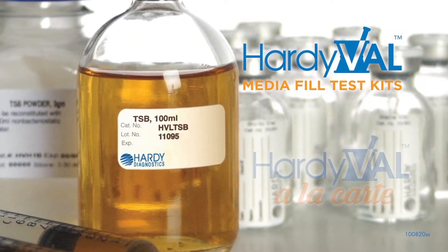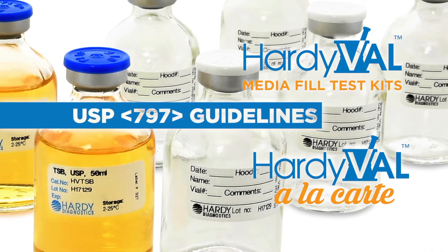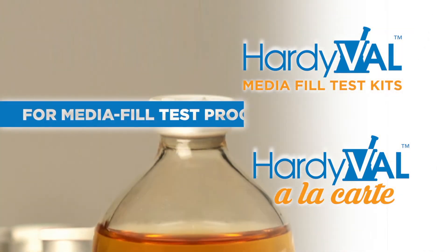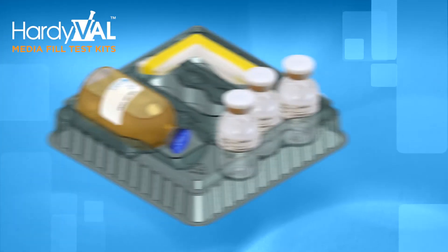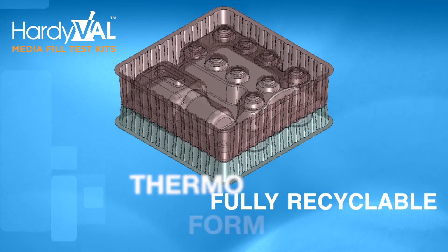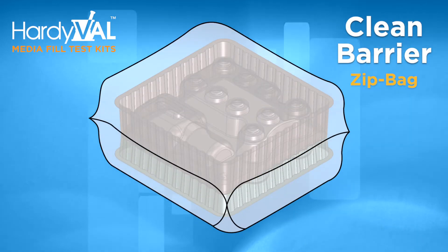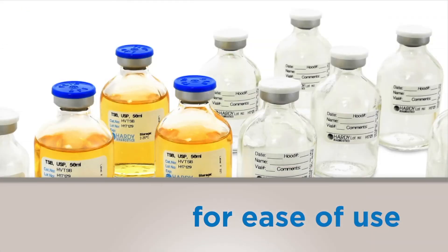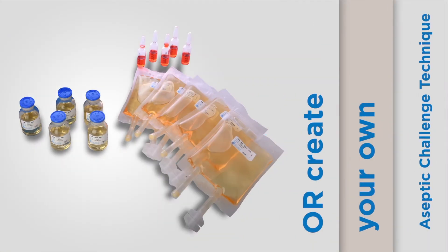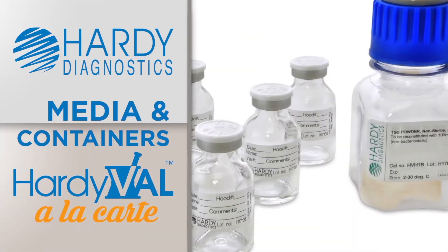Hardival kits and Hardival a la carte components are designed to help you follow USP 797 guidelines for media fill test procedures. Hardival kits are now packaged in fully recyclable thermoform. An added clean barrier zip bag helps mitigate particulates. Choose from five pre-assembled kits for ease of use, or create your own aseptic challenge technique with our a la carte line of Hardy Diagnostics media and containers.